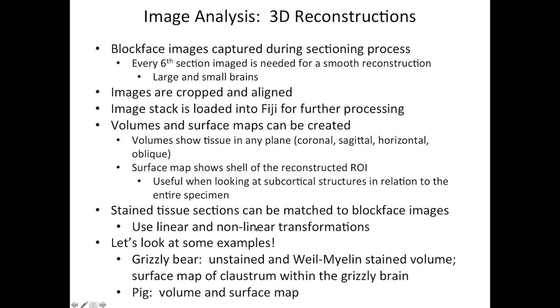So what I'm going to show you first is the block face stack. This is rather small. Let me blow this up a little bit for you guys. So these are the block face images taken while the tissue is being sectioned. And this stack has actually not been aligned. You can see it bouncing around a little bit.